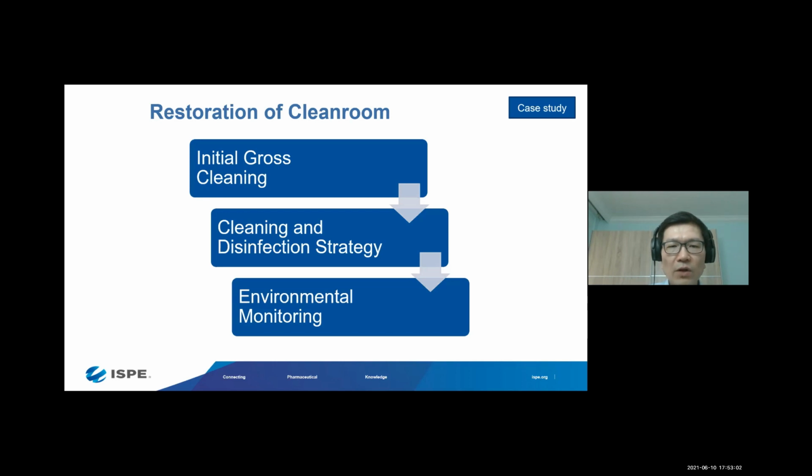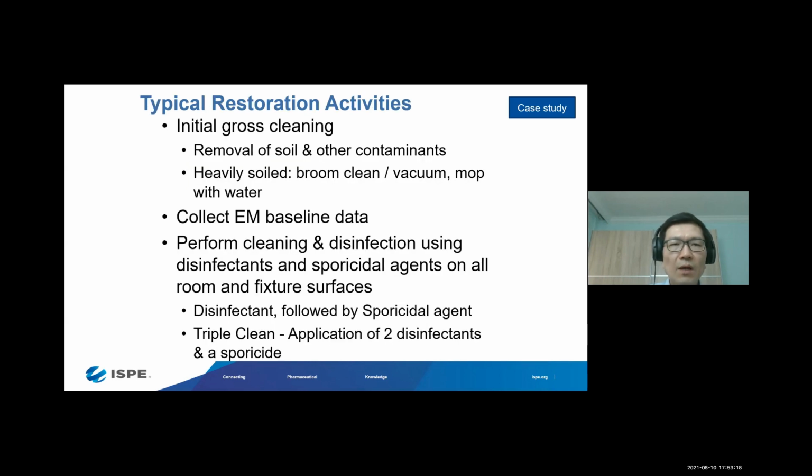And then the last one, of course, is the environmental monitoring plan, at which time points to conduct the environmental monitoring. I'll go through this later on. Next.